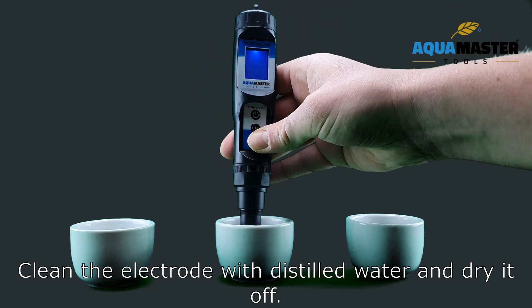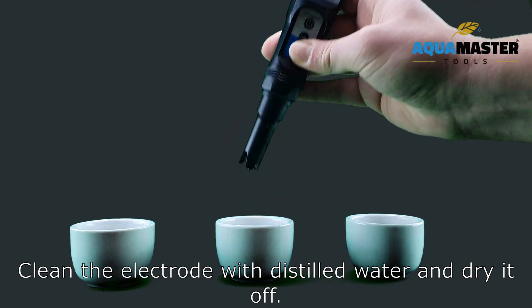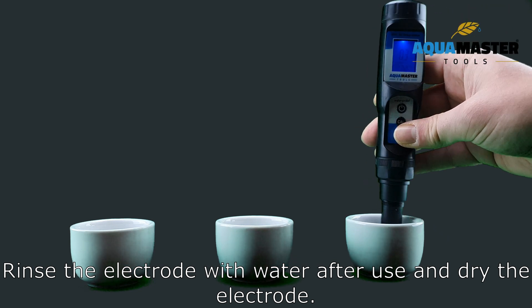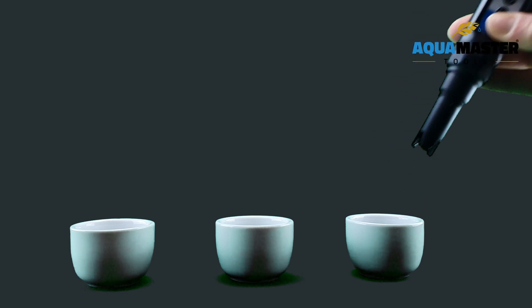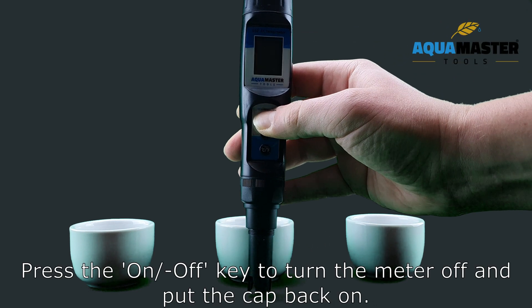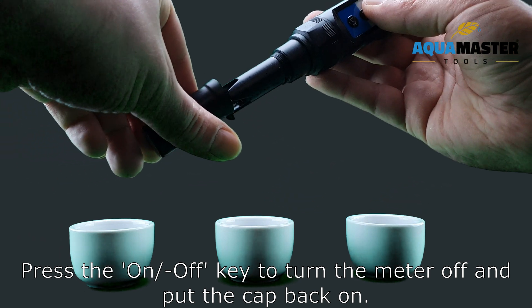Clean the electrode with distilled water and dry it off. Rinse the electrode with water after use and dry the electrode. Press the on-off key to turn the meter off and put the cap back on.